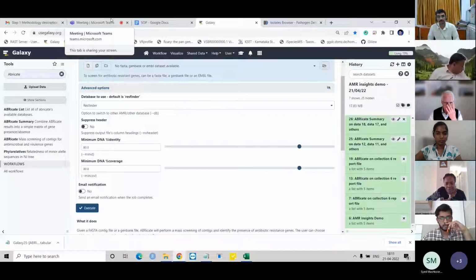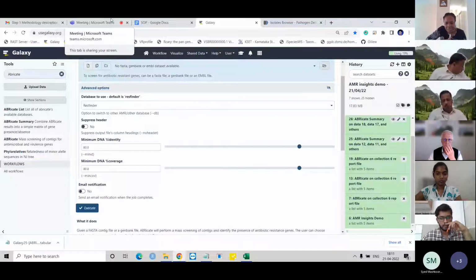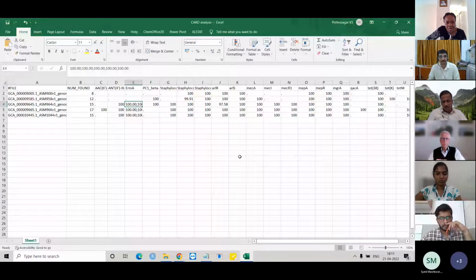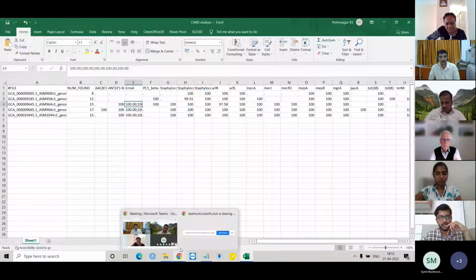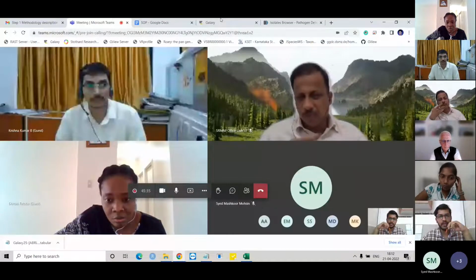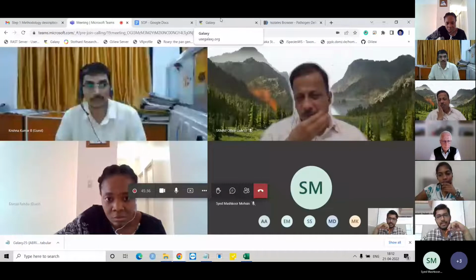Sorry, I have a question. Please, can you go to the Excel sheets? Why are we having just 5 results? Is it that we have just done the first 5 genomes? No. Actually, we have uploaded only 5 genomes today, because uploading the data takes a lot of time. Since it is a demonstration, we have uploaded only 5.